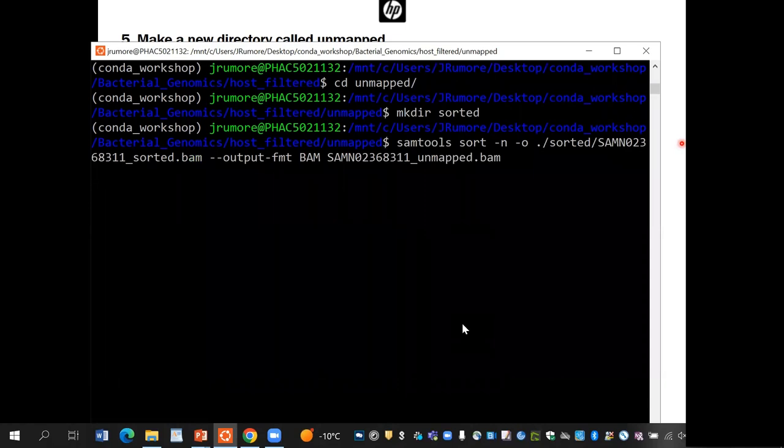Okay. And then the next thing we're going to do once this finishes running, again, shouldn't take too long, is convert our BAM file back into FASTQ. Because we need to have the data usable for downstream analysis like taxonomic classification. We will be using this data set next week to perform taxonomic classification, okay? So don't delete this folder, not until the end of the workshop.